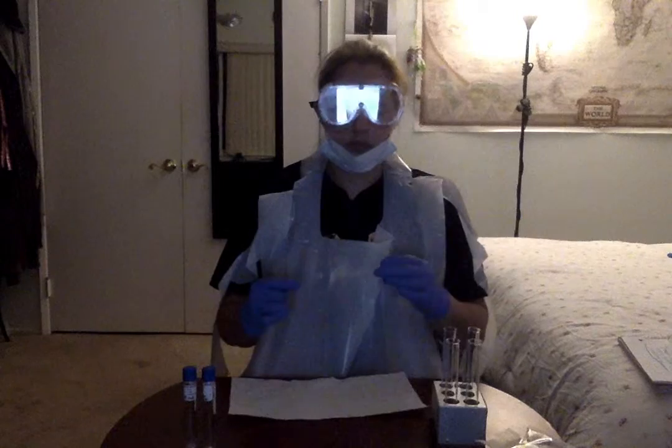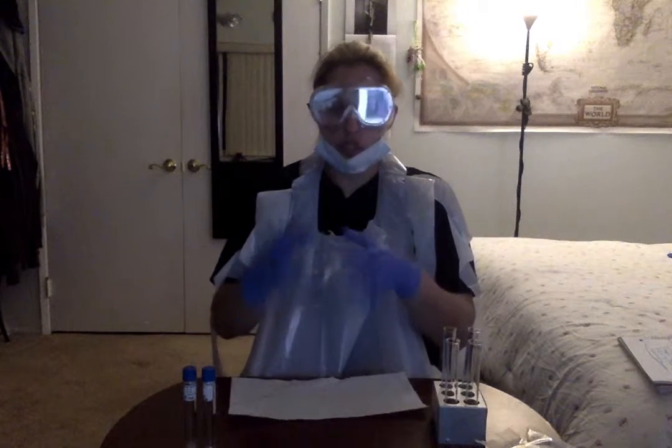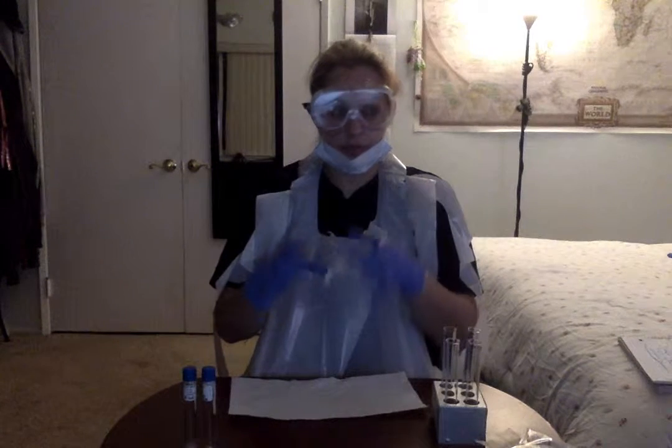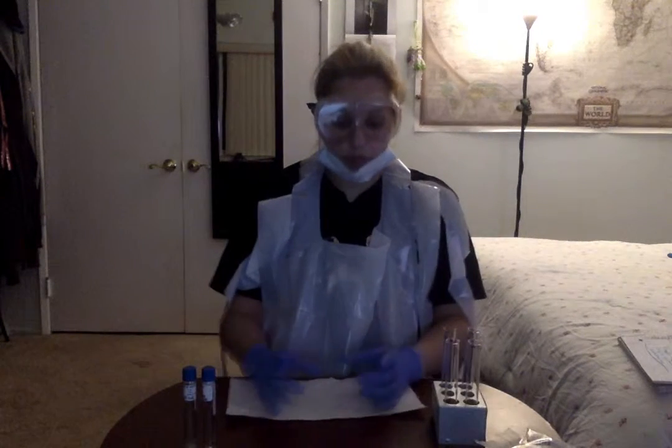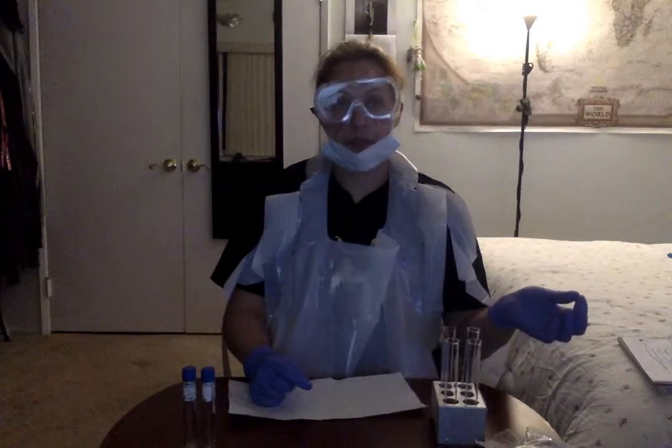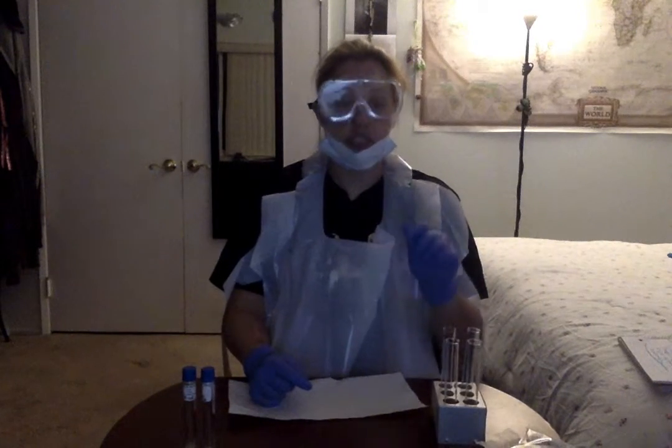The next part of the lab for this week was a catalase test, and that really just involved smearing 2 microscope slides with E. coli culture and also S. epidermidis culture out of the plates, not out of the broths, which I found very interesting. Then we took 1 drop of hydrogen peroxide and applied it to each.